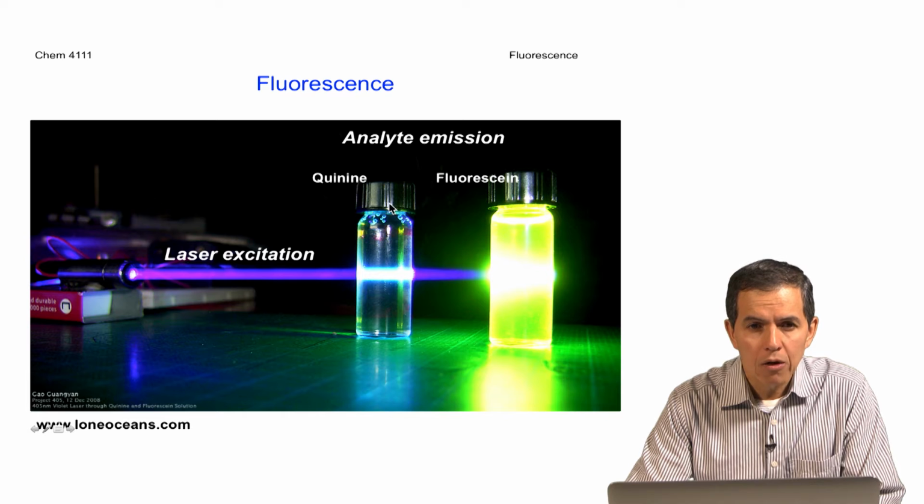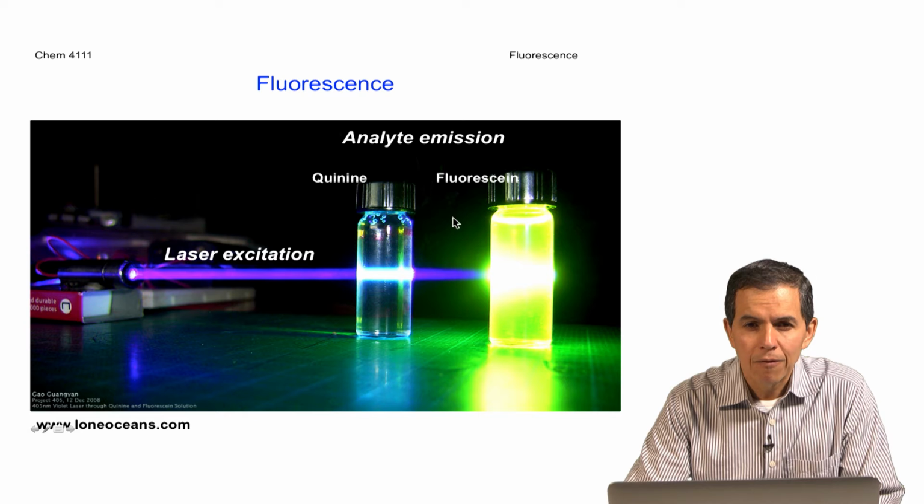And as we can appreciate, quinine has a blue fluorescence that results from excitation with a shorter wavelength from a violet laser. Similarly, the fluorescence from fluorescein is yellowish greenish in nature, corresponding to the excitation of this analyte by the same laser, the violet light from this laser.